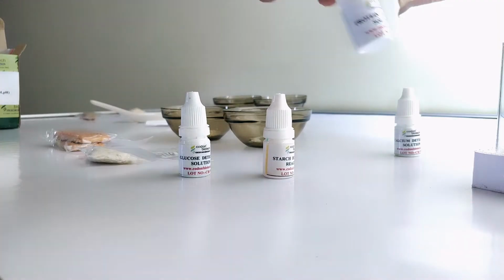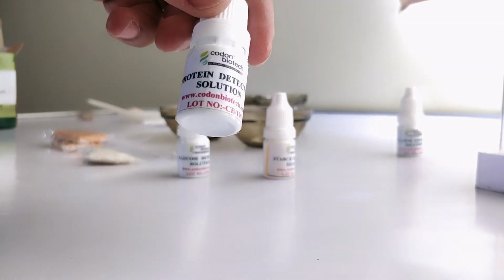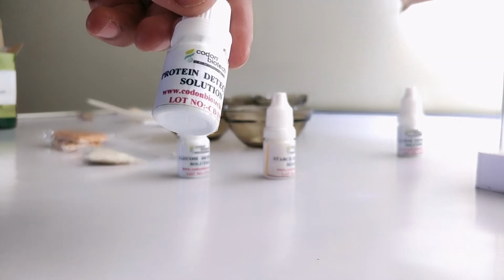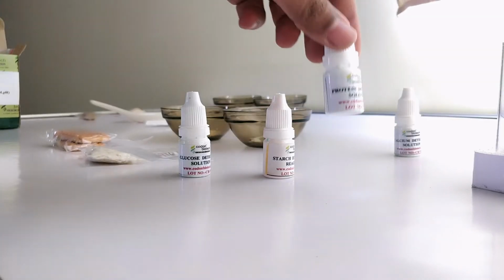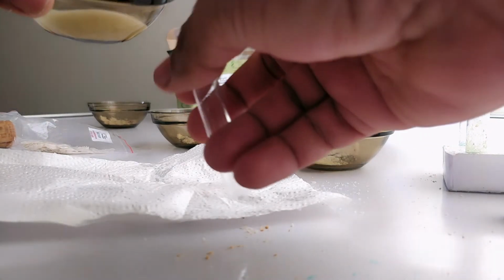Let us do the protein test. For that we need protein reagent. This is copper sulphate solution, which will be used to mix with the food ingredients. Now we will try with the milk. Let's put it in the test tube.